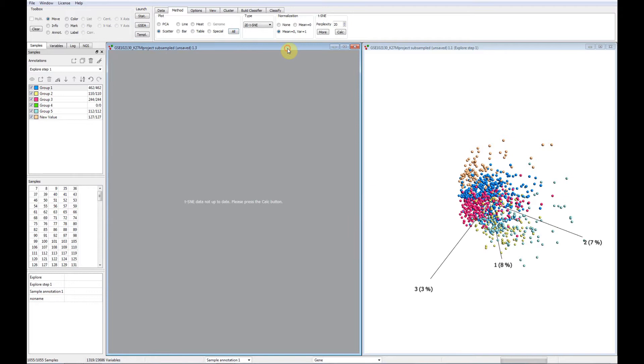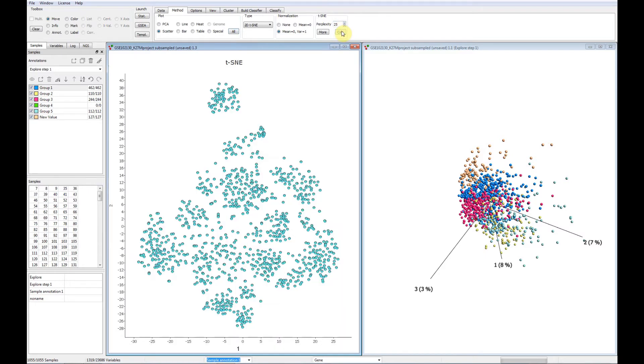We see one PCA sample plot and a T-SNE plot that soon will be populated with information. We set it up by selecting the perplexity parameter.